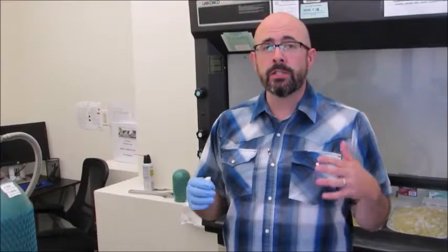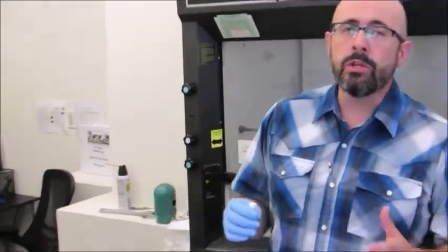So to do that, we actually dissolve the entire crystal. We do that process up in a clean lab, which is an environmentally controlled laboratory up on the 4th floor. We're probably not going to go up there and view that today because you have to get a lot of safety training and you have to get all gussied up in a bunch of clean workwear to go in there.